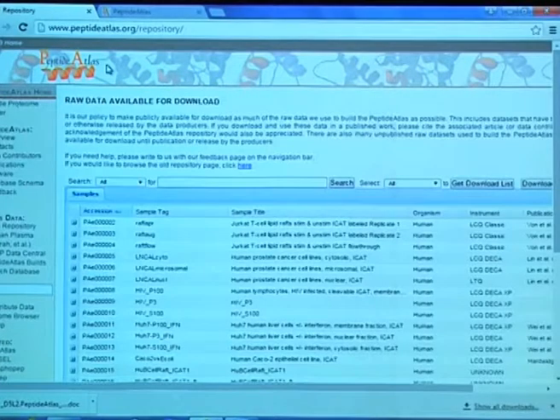So go ahead and do what it says in number 2 here, which is click on the data repository. That link is on the left navigation bar right underneath Atlas data. What this is doing is going off and fetching a number of experiments. It's a sufficient amount of data that, over the wireless network, at least yesterday, it was taking quite a while. So I suspect you may have some difficulty loading it.